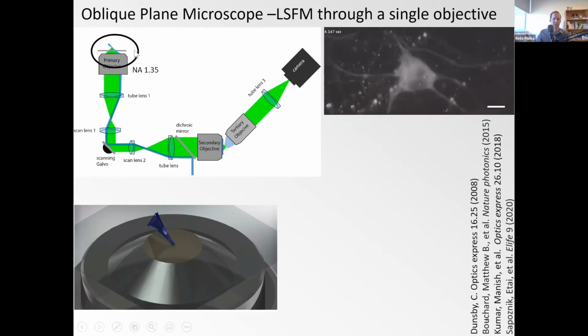But back to, that's just the short history of that technique. But what is going on here is that, yes, you leverage the high angular aperture of this objective to, at the very marginal rays, launch the light sheet, and then the fluorescence you detect would obviously not lie within a focal plane of this objective. So if you were to put the camera here, not much of the light sheet would be sharp.